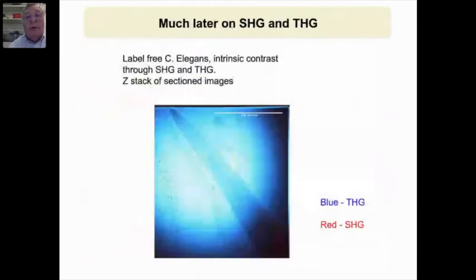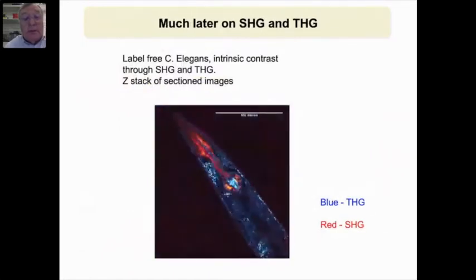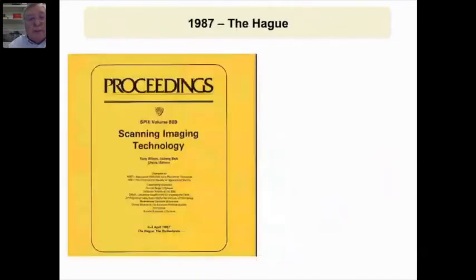A bit later on, we were able to do third harmonic and second harmonic, and here are third harmonic and second harmonic images focusing through a C. elegans nematode. Things have really improved rapidly.